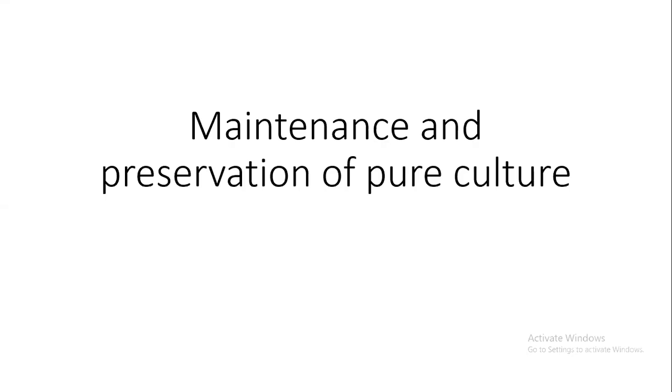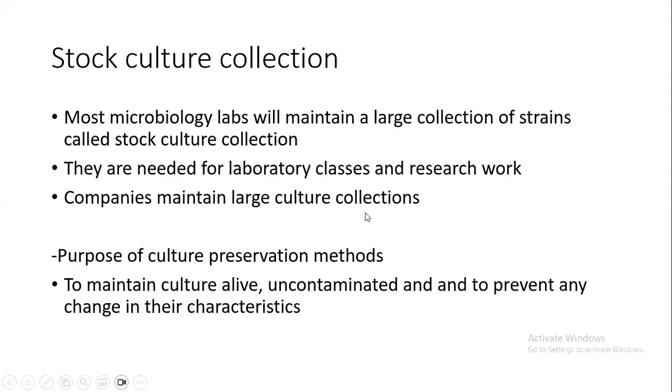Hello students, in today's class we are going to learn about methods for maintenance and preservation of pure cultures. So basically we have already learned what pure cultures are. Pure cultures are basically growth of one particular strain of organism that has been isolated from various sources.